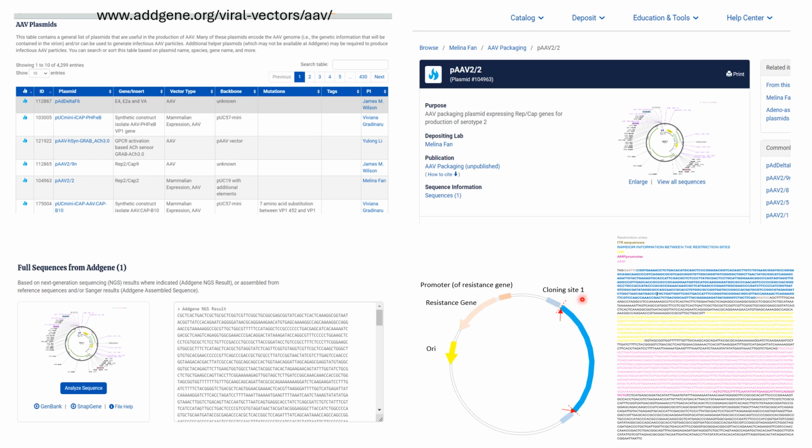You see here in gray, I have highlighted the cloning site 1 in gray. You see here the random sequence, I have highlighted it in blue. Then we have the cloning site 2 that is highlighted here again in gray. Then we have more random information in here that is represented by black. Then we have the ORI here. Then we have more random sequences, and then we have the resistant gene and the promoter. You see here, this is the resistant gene and this is the promoter.